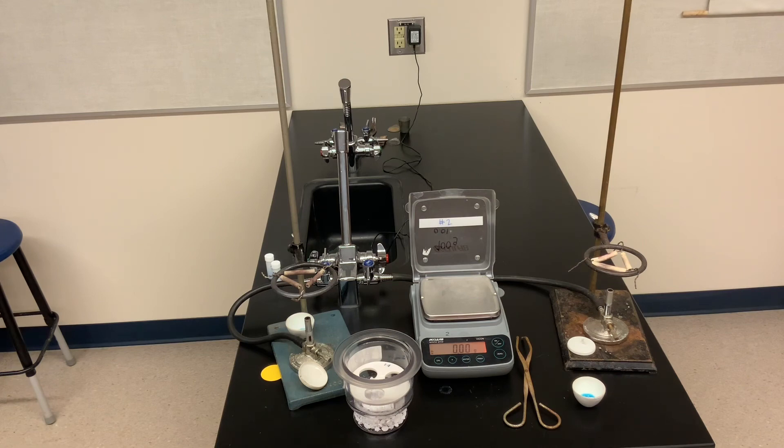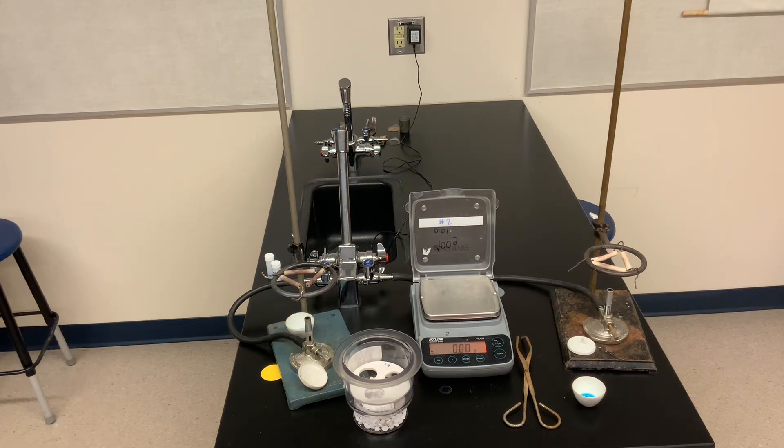So you now have enough data to calculate the mass of the hydrated salt samples that we used. You can also calculate the mass of water that escaped during the heating. And you can also calculate the percentage of water in the hydrated samples. And that's the goal of our experiment to calculate the percentage of water that was in the copper 2 sulfate hydrated salt. So good luck with your calculations.